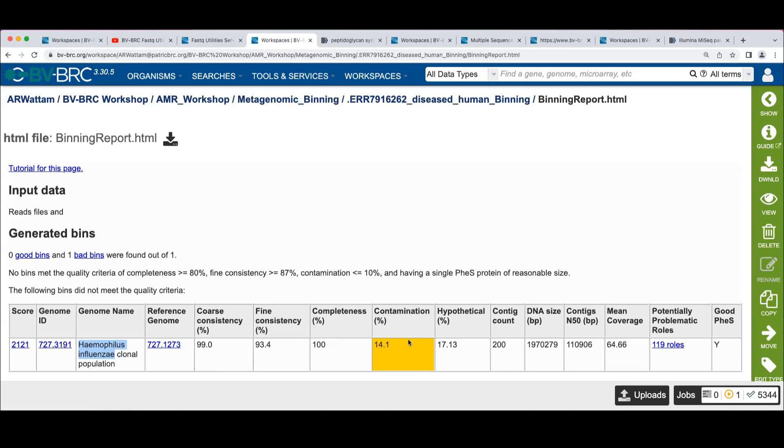We've got contamination, which may or may not be surprising given what else we saw in the classification.